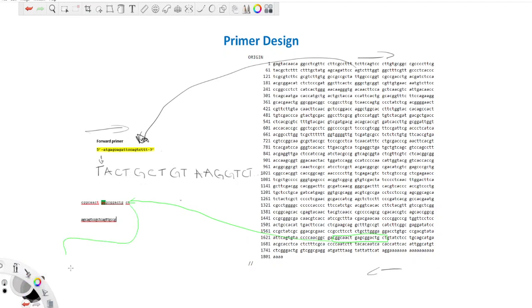And this is going to become my A. And this is now going to be G, and this is going to be C, and now I got that A here. Then I have my G, and I have another T, and I'm going to stop maybe here when I have another C. So if you see, it's A, G, C, A, G, T, C, which is also here A, G, C, A, G, T, C. And that's how you actually find your 5' and your 3' there.